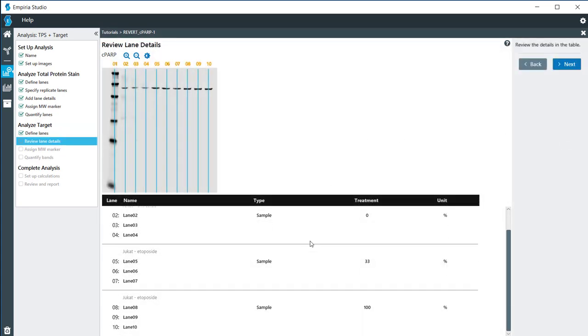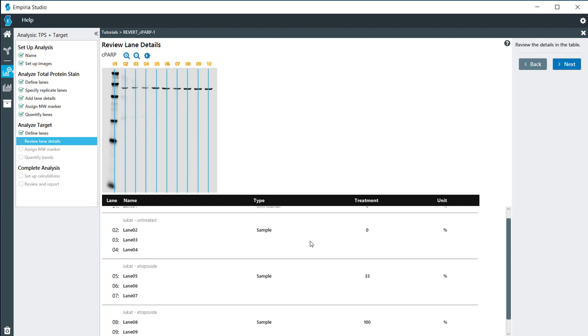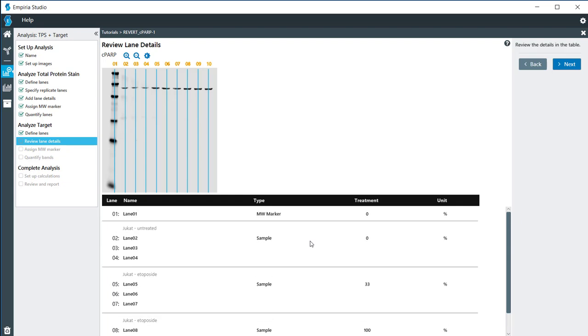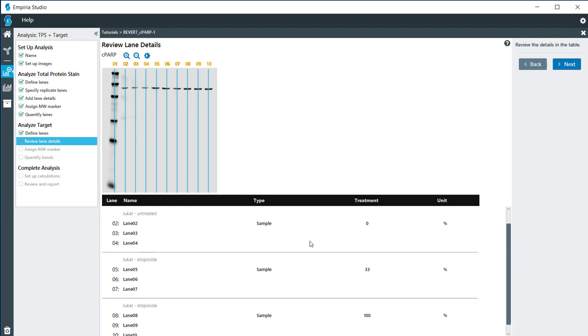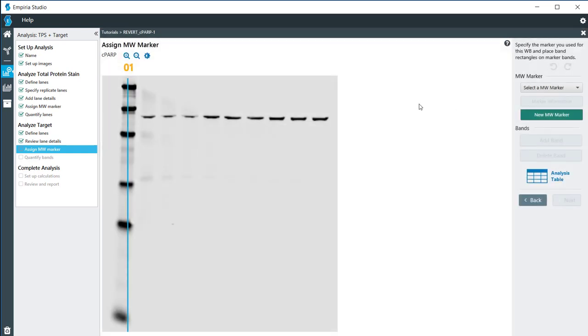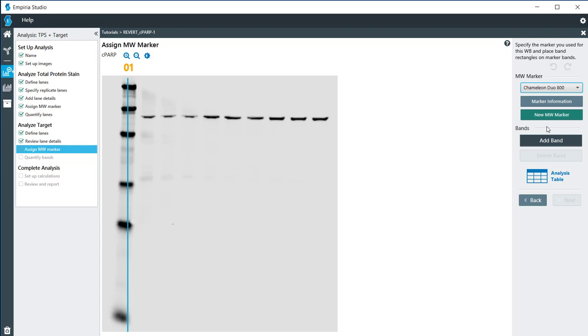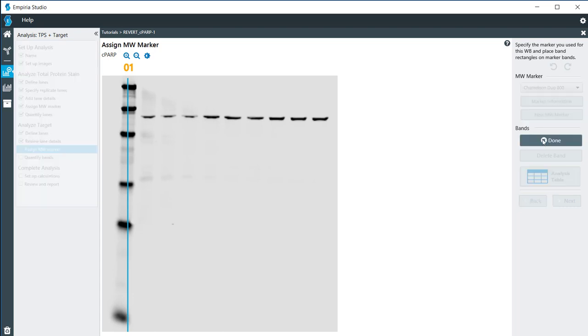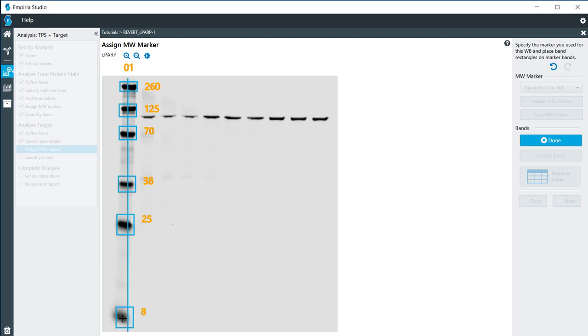This is just informational for you. There's nothing to edit in this table right here. I'm going to click Next. For my molecular weight marker, I have the Chameleon Duo 800 marker. I'm going to click Add Band and then Done.